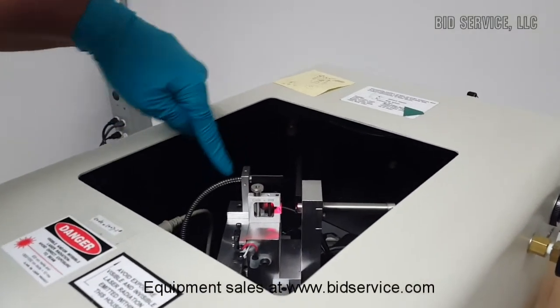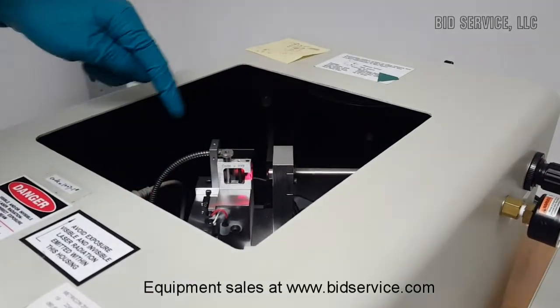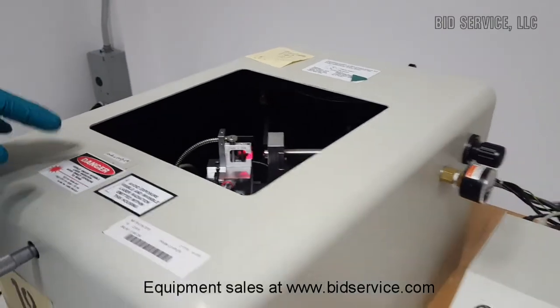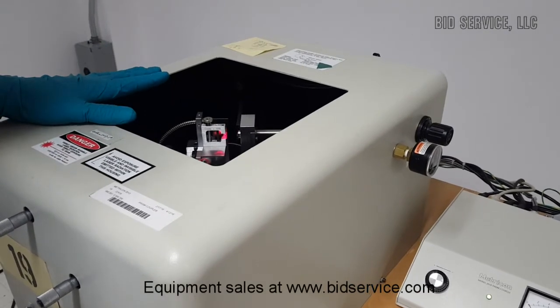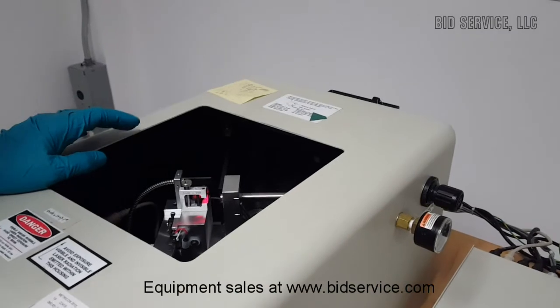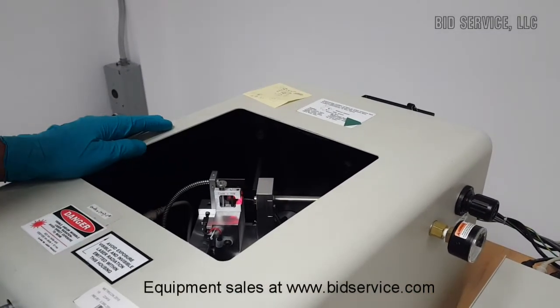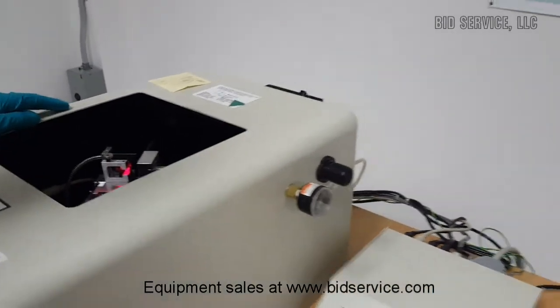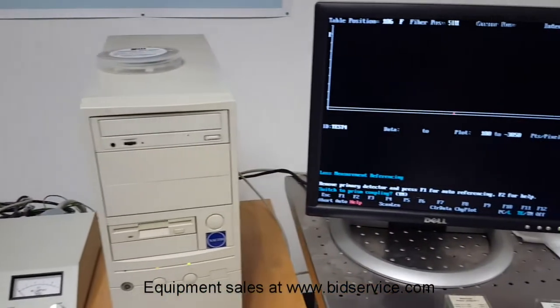You can see the detector starts to move, and I'm not going to allow it to go because for fiber or waveguide loss measurements, proper assemblies ought to be mounted here. So I'm going to switch it back to the prism coupler and say yes.